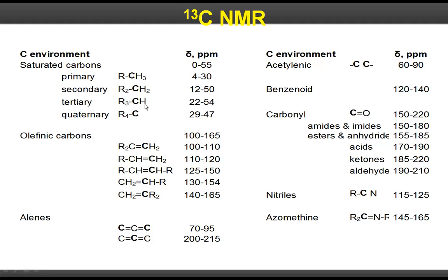Secondary carbons, which in turn have two alkyl groups, you would expect them to vary from 12 to 50. For each substituent, even if it is carbon, you get a downfield shift. Okay, you get a higher chemical shift. For olefinic carbons also it's true. The tetrasubstituted alkenes would come at a higher chemical shift than the monosubstituted or disubstituted alkenes. This is the carbon that we are considering. The bold carbon is what the chemical shift corresponds to, not the rest of them.